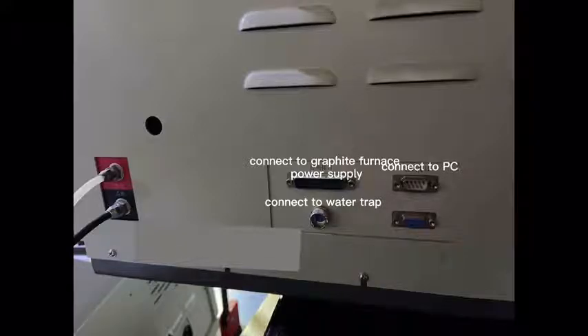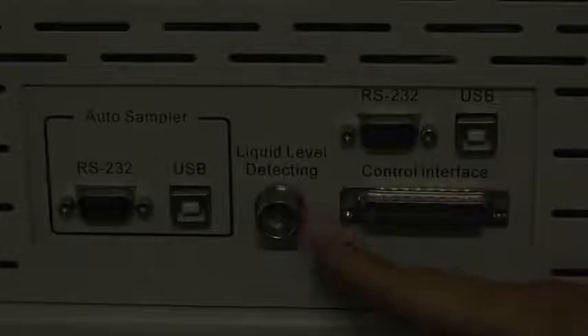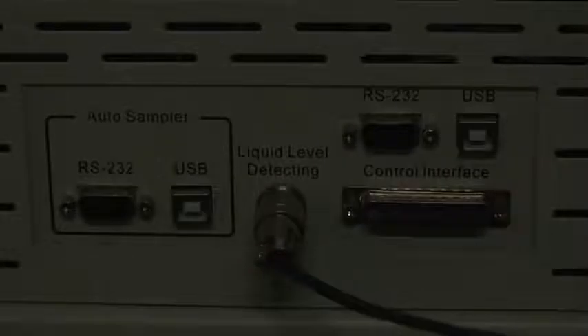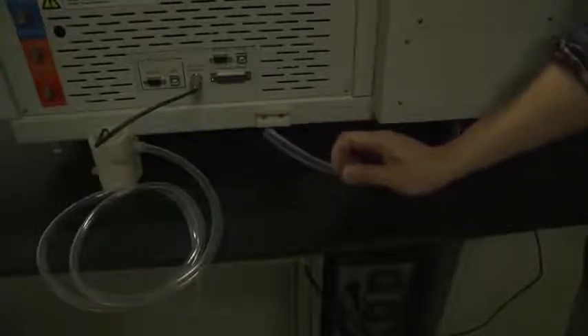Let's have a look at the rear of the instrument. This is for the power cord. This is for connecting the water trap. There is a plastic tube underneath the system for waste water from the mixing room; connect it with the water trap.